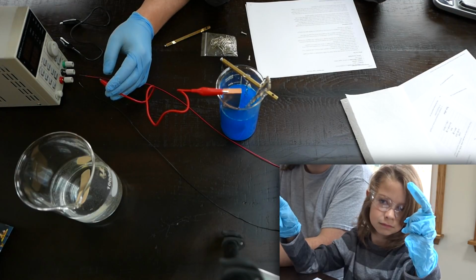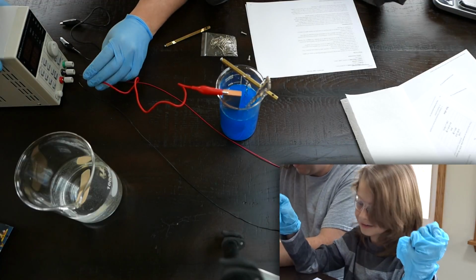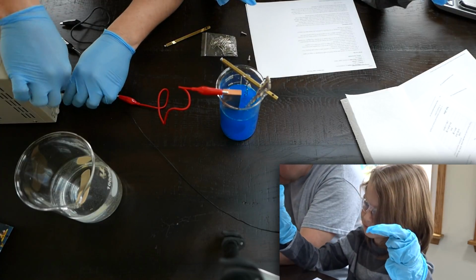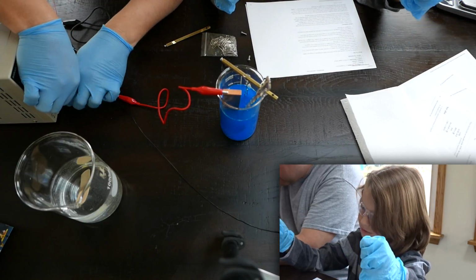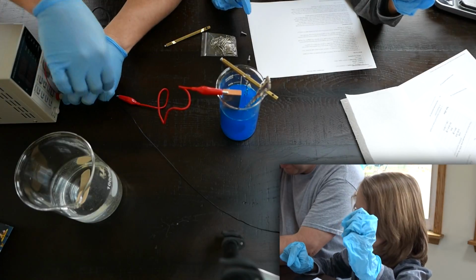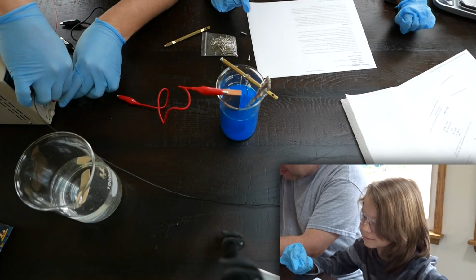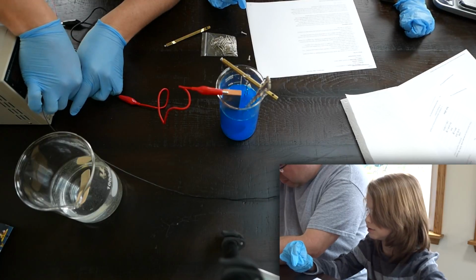That's interesting. We're all good, right? That's the egg bot. And then it says attach the negative one to the fork or something. Just attach the negative one to the quarter or the fork. I think probably the fork, because it's the only one hanging out of the water. Well, we're going to attach it to the brass. Oh, we're attaching it to the brass.